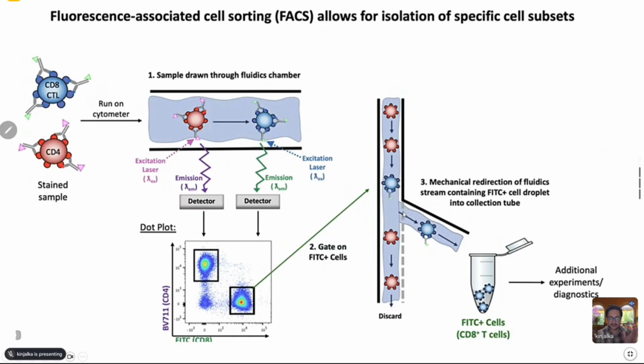you can see okay, all these cells which are there in this region, I want them sorted in a specific tube or something else. So when you have these cells, then you can maybe do a cell culture with these cells. You can look at single cell proteomics, genomics, look at all those things in those cells.